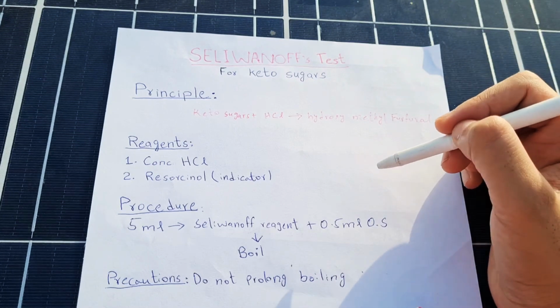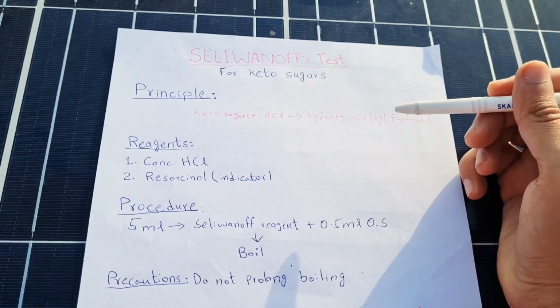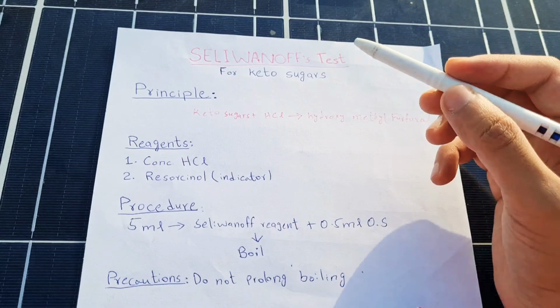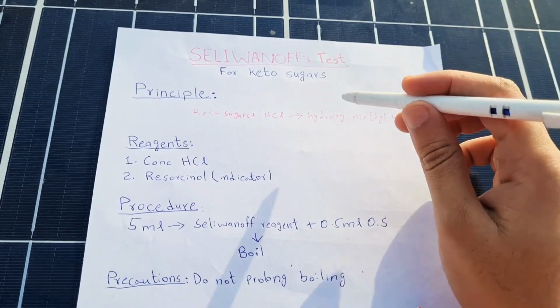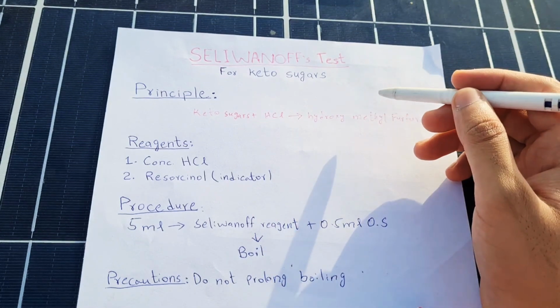As we know, keto sugars are more reactive than aldo sugars, so these keto sugars will immediately produce that colored substance while aldo sugars will take time. So this is the basic principle which helps us to differentiate between keto sugars and aldo sugars.